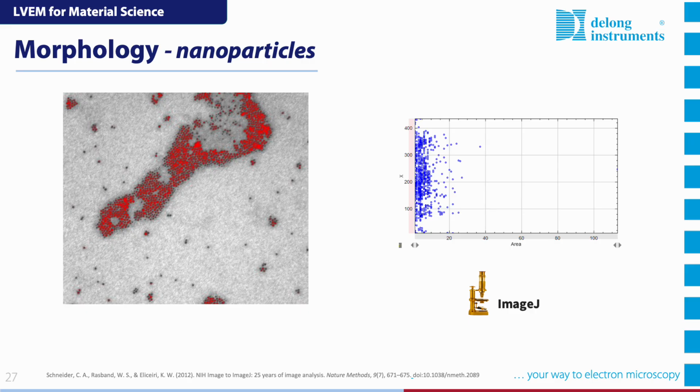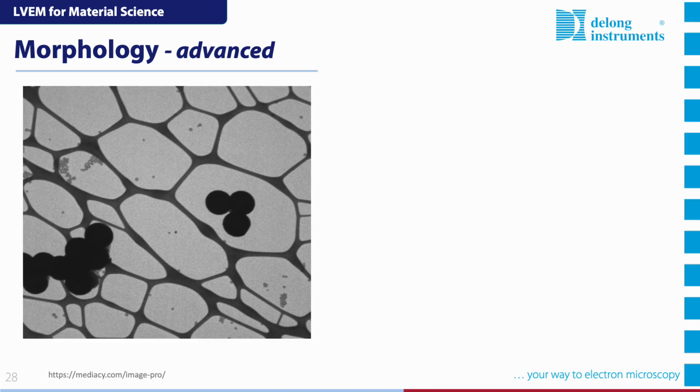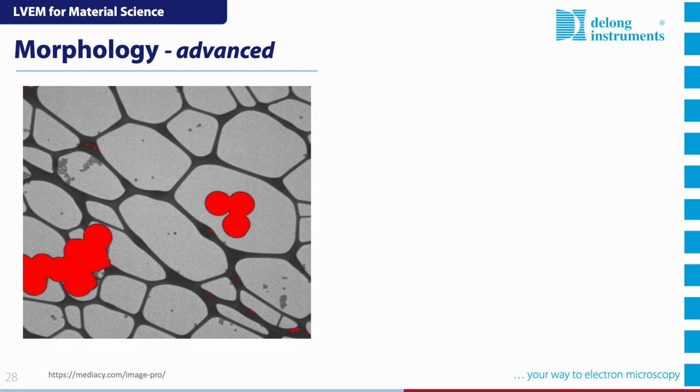By pairing EDS with STEM imaging, we can identify the metals present in a sample and even get semi-quantitative estimates of their composition. This allows us to correlate the elements' information directly with particle morphology, helping to understand material properties, including composition.